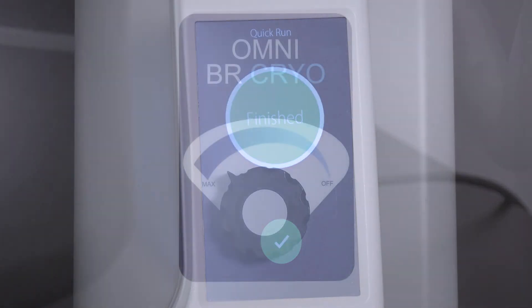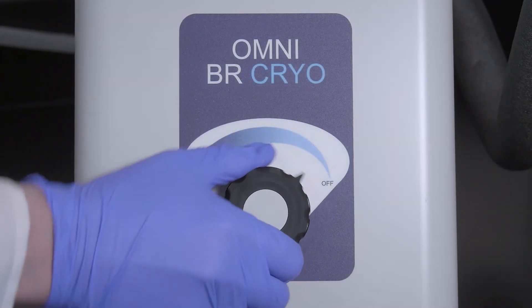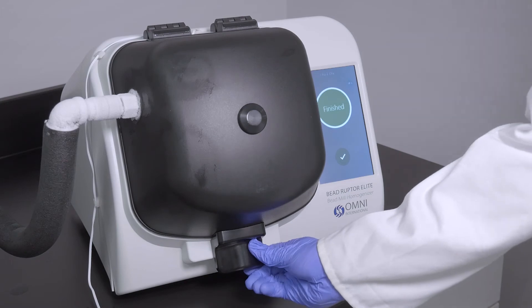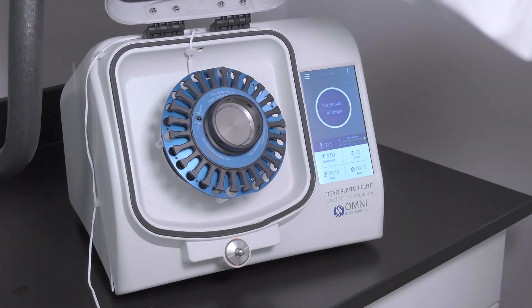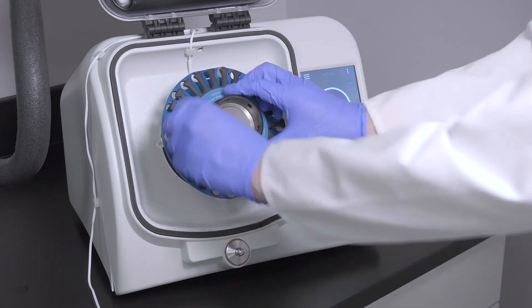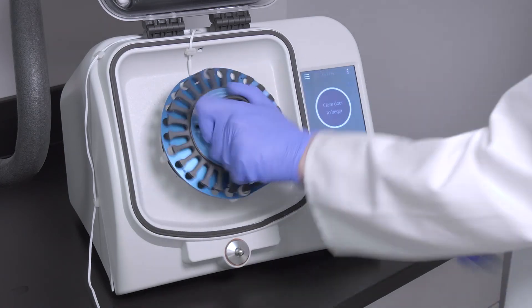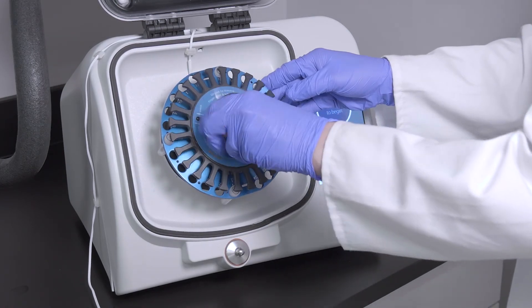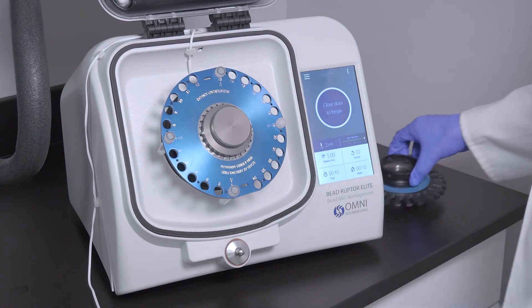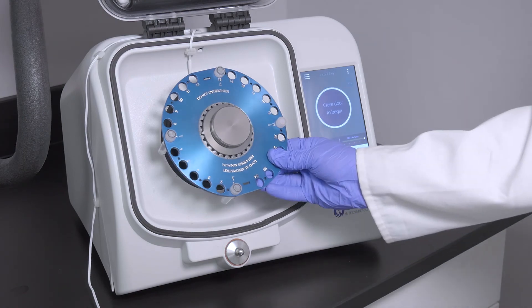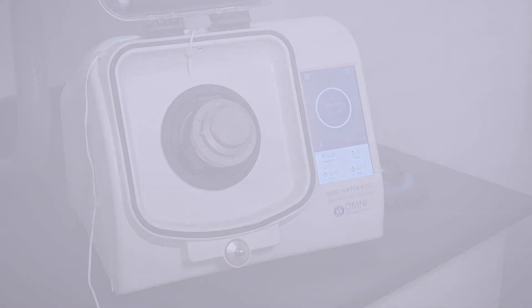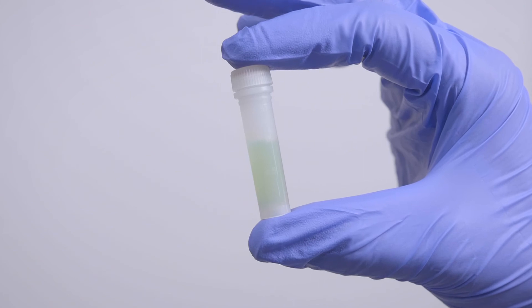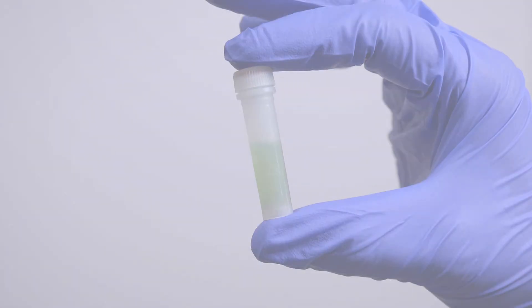When the cycle is complete, return the BeR Cryo control knob to the off position. Open the BeadRuptor lid and remove your samples.